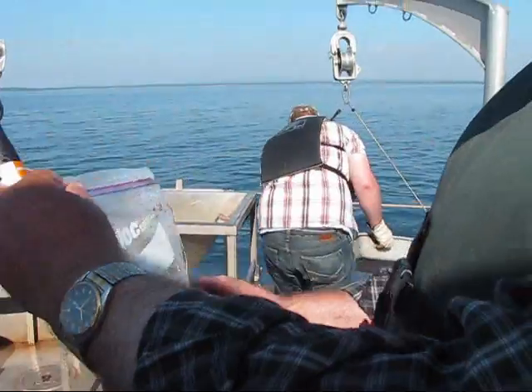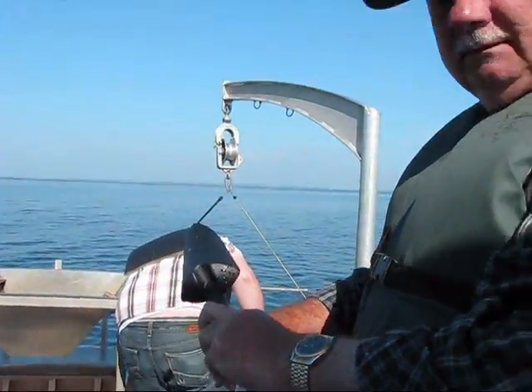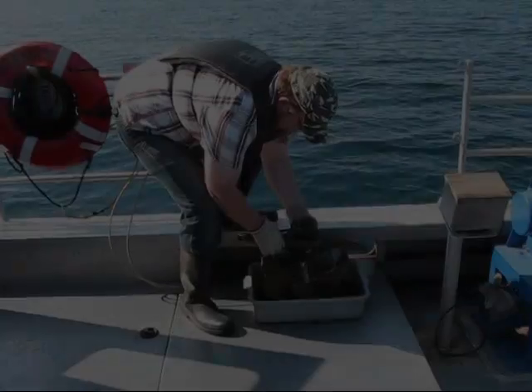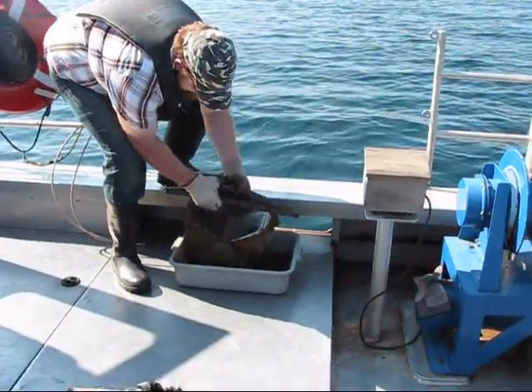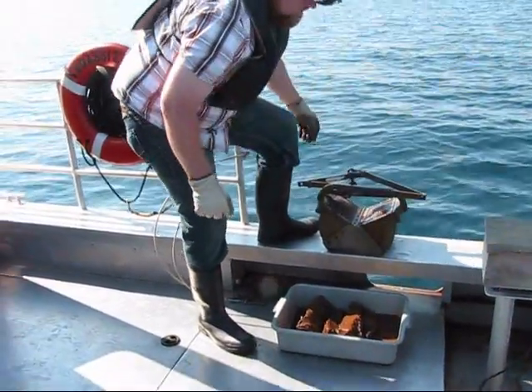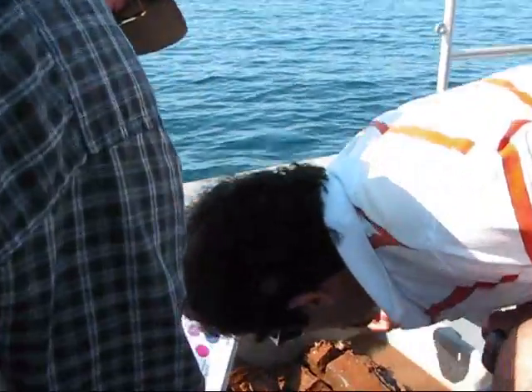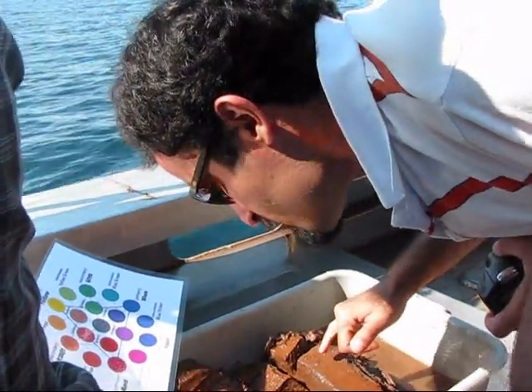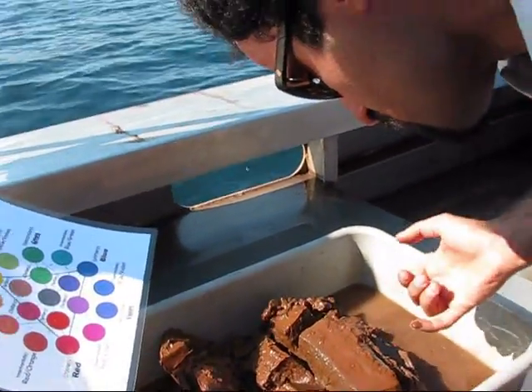The more reddish is the deeper. Okay. What values was he getting? Average value? I'll take 1.2, but it does have that dark. See in the cut too. Yeah. Little grains on it. Yeah. Could be stamp sand grains. This is the top. That's the top. Okay. Yeah.